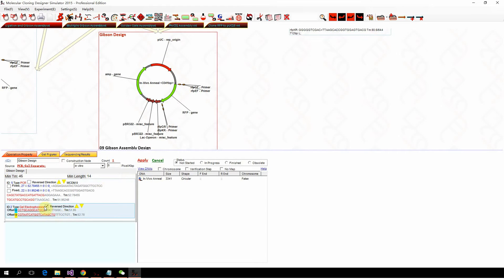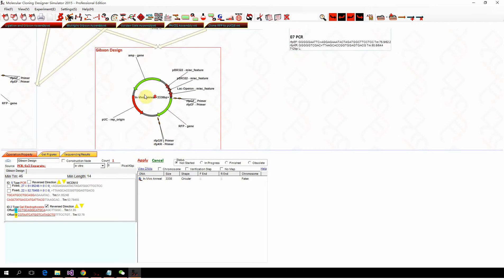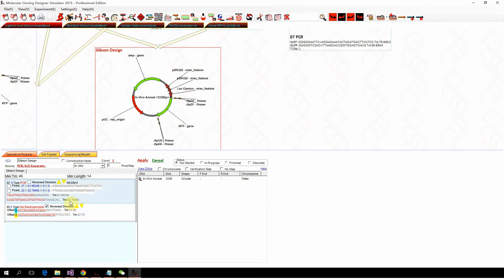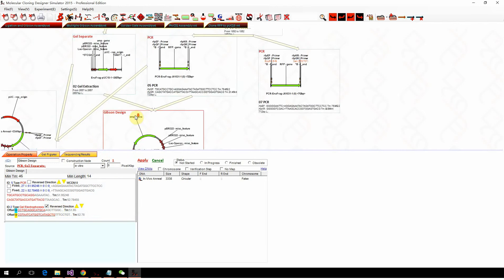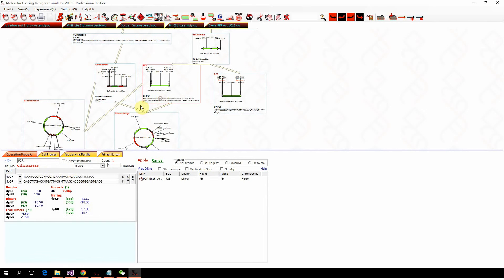If we click this one and click apply, they will be different. They will be in different direction because the PCR fragment was set as reverse direction. Also, we can attach some additional sequence in the PCR node.